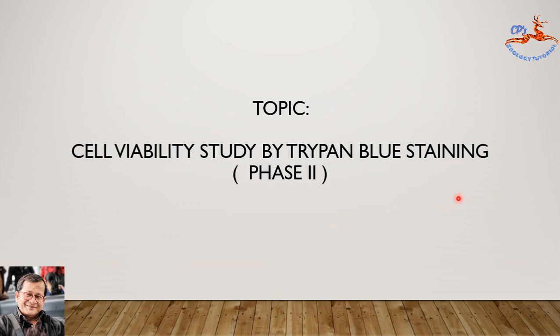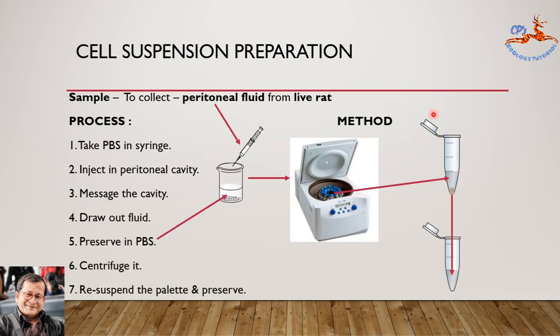First of all, let us make the cell suspension from the test sample. Our test sample is a live rat, and we have to collect the peritoneal fluid from the body of the rat by syringe. Take a suitable syringe and take PBS of 1x strength — at least 5 ml capacity. Now inject this PBS solution, 2 ml quantity, into the peritoneal cavity of the body of the rat.